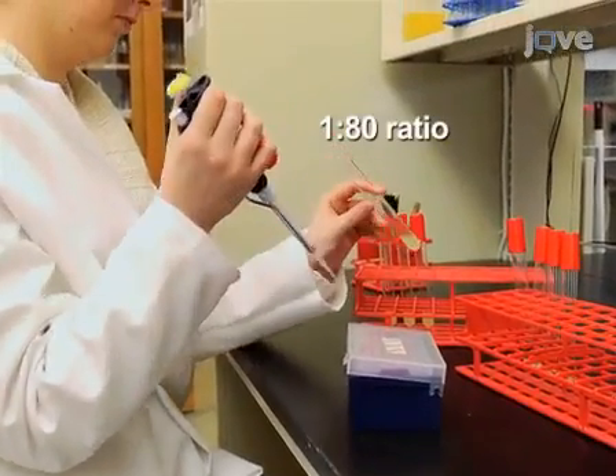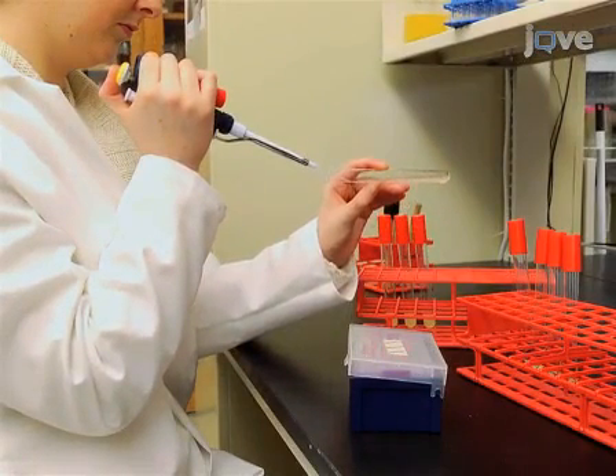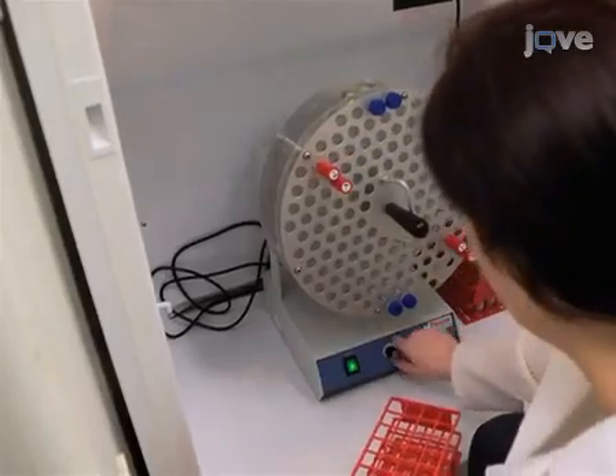On the following day, subculture 37.5 microliters of the bacteria into a fresh tube of 3 milliliters of LBS and grow for one hour with aeration.